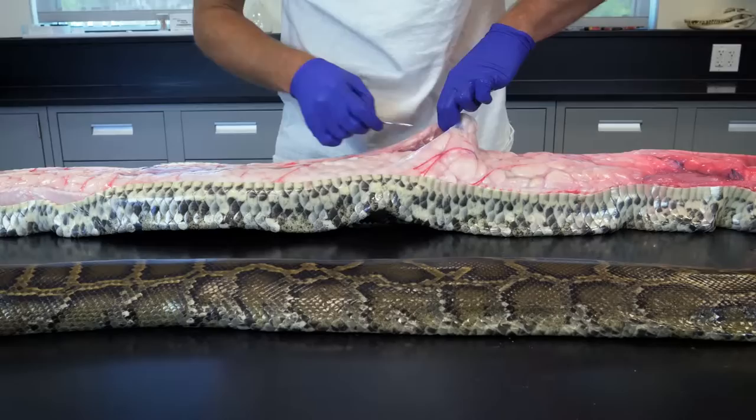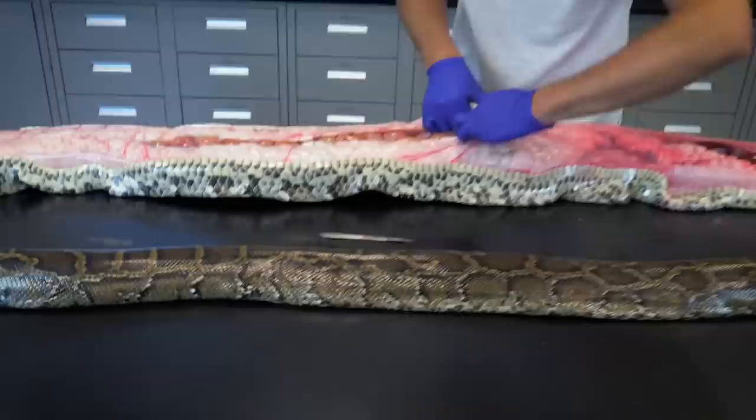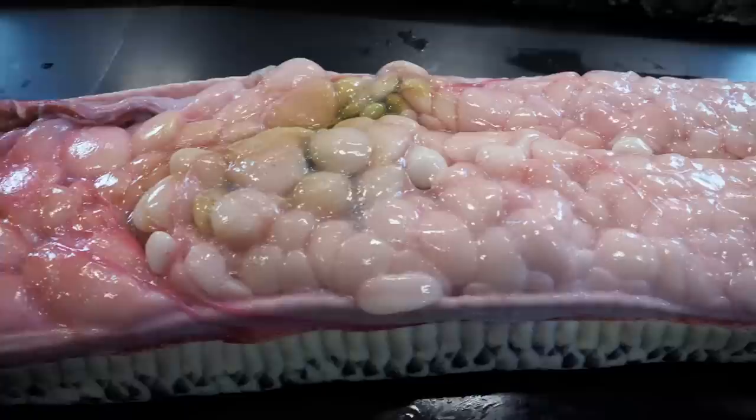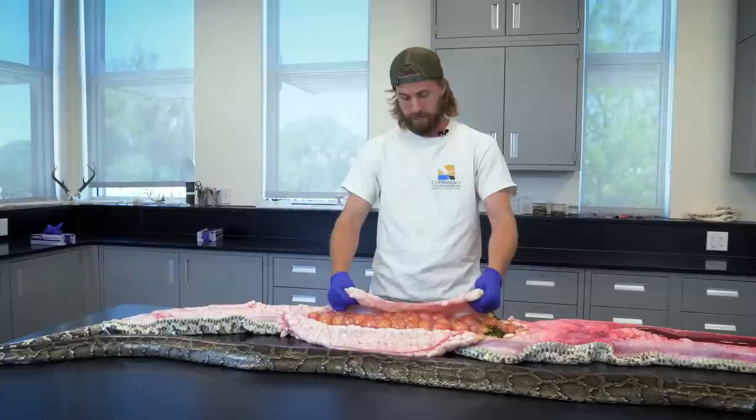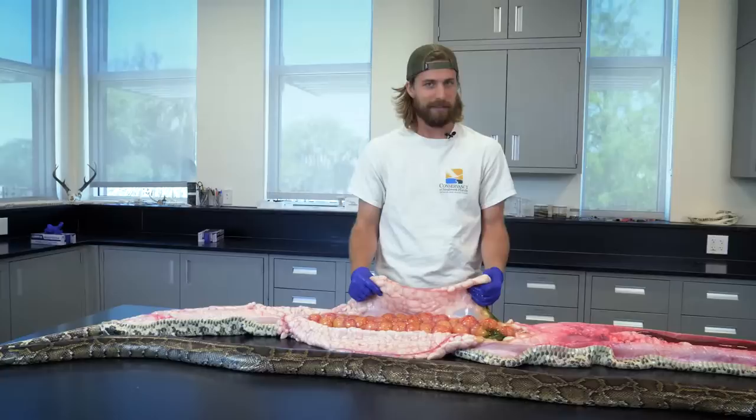Now that we've checked out the lungs and looked at all the other internal organs, we're going to expose the reproductive system and the digestive system. When I see all this fat tissue, this is all the animals that the python would have eaten during the summertime, during the feeding season — that's all your rabbits, all your opossums, all your raccoons, bobcats even, maybe deer. All of those animals were sacrificed in order to raise this next generation of Burmese pythons.